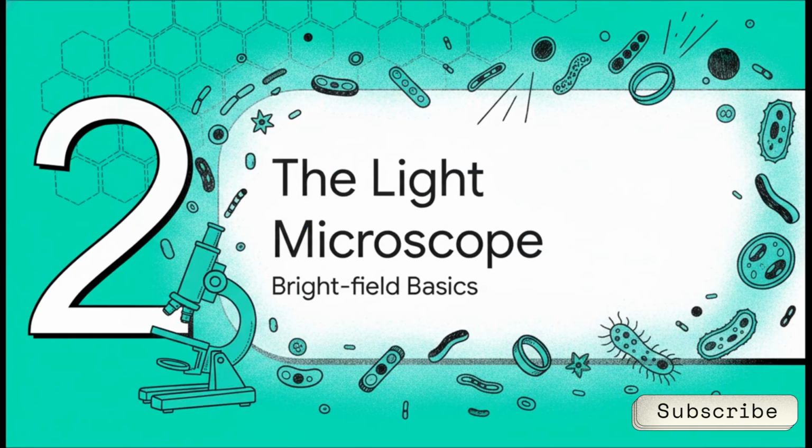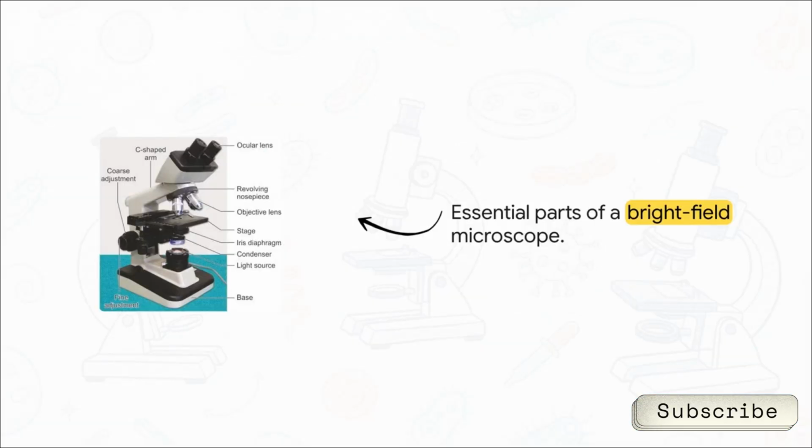Moving right along to Section 2, the light microscope. If you get a question on the bright field microscope, you need to be ready to reproduce its core components. The easiest way is to mentally group them into 3 distinct parts. First, you've got the mechanical parts, the base, the C-shaped arm, and the stage. Second are the magnifying parts, the ocular lens up top and the revolving objective lenses. And third, the illuminating parts down at the bottom, the light source, the condenser to focus the light, and the iris diaphragm to actually control it.